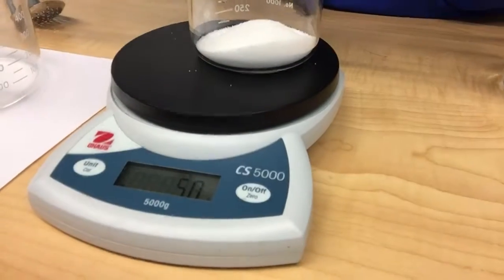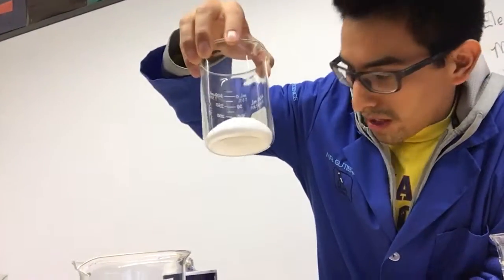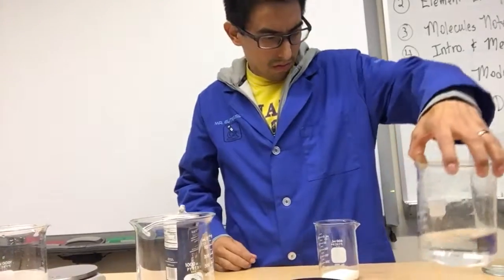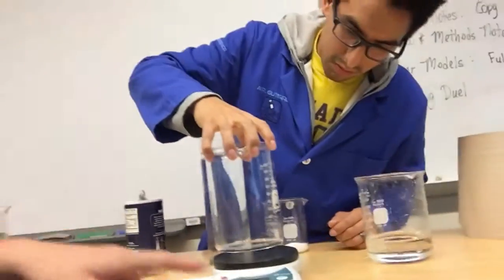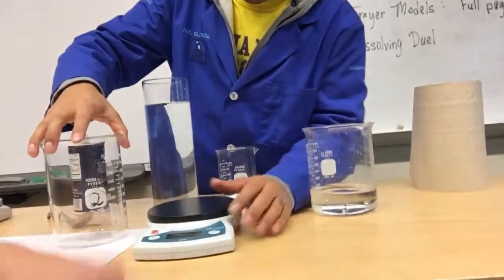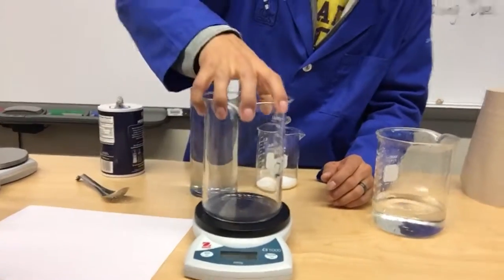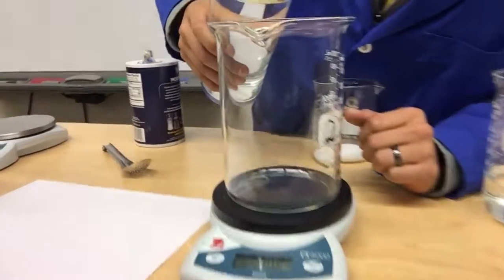All right. A little bit more. There we go. So we got 50 grams of sodium salt in here. Now, before we get started, we need water. So how many grams of water did you do? I did it with the water on the scale. Hold on, I gotta zero it out. All right, let's zero it. The water and salt combined with the beaker is going to be 1,000 grams.